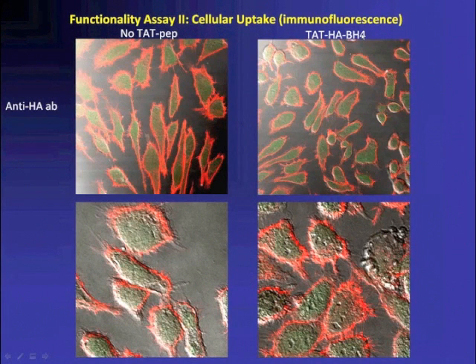Therefore I wanted to raise the concern that when one uses this PreScission protease, there is this proline that always will be in front of your peptide of interest. And this might really obscure a little bit the TAT cell-penetrating sequence. So I think this might be an issue that one needs to solve if one wants to use this method to develop bona fide cell-penetrating peptides. But it might also be an issue just because of this combination, and that it's nothing to do with the cloning, but we did not further assess that.